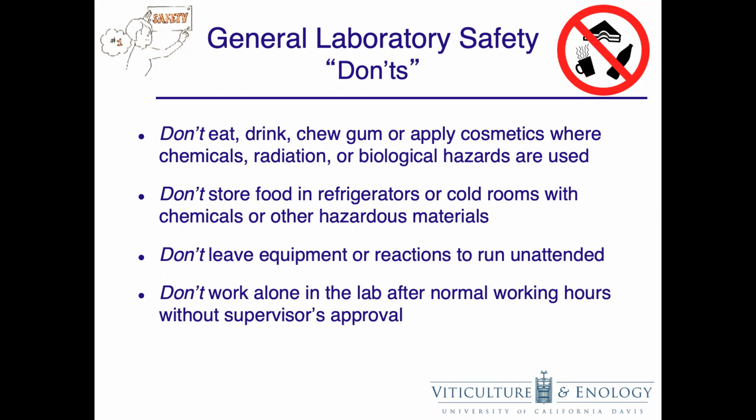Don't leave equipment or reactions running unattended. This could lead to unwanted accidents. Don't work alone in the lab after normal working hours without supervisor's approval. There may come a time where you may need to do some work alone in the lab. However, you must discuss this with your PI. There may be some procedures where working alone poses a hazard and is therefore not allowed.